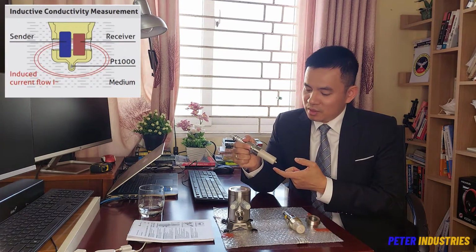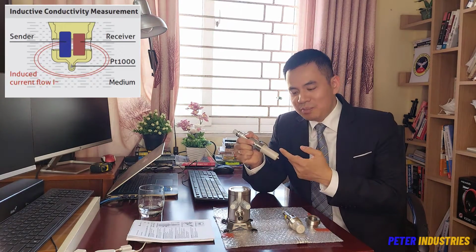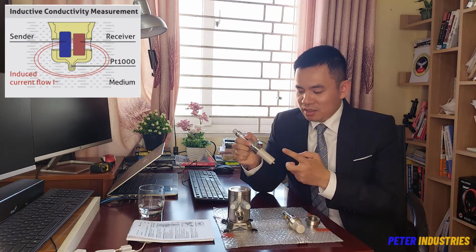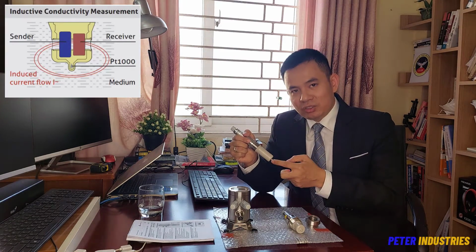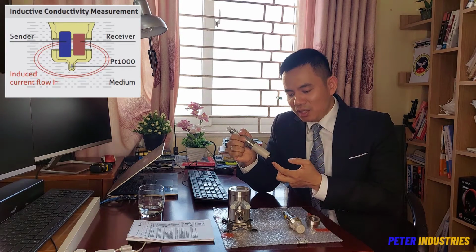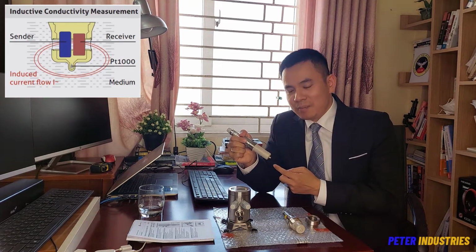And this sensor operates based on the inductive principle, referring to Faraday's laws of induction. There are two coils inside, the sender coil and the receiver coil. An alternating current is applied to the sender coil, which generates an induced current running in the media, but the media must be conductive.